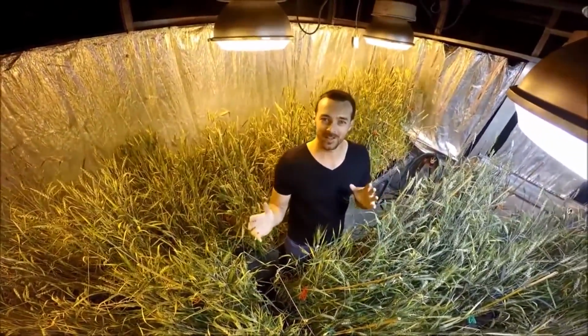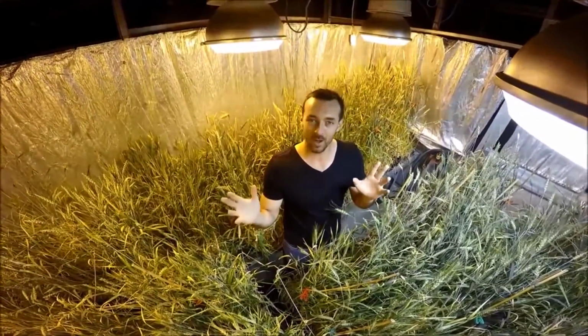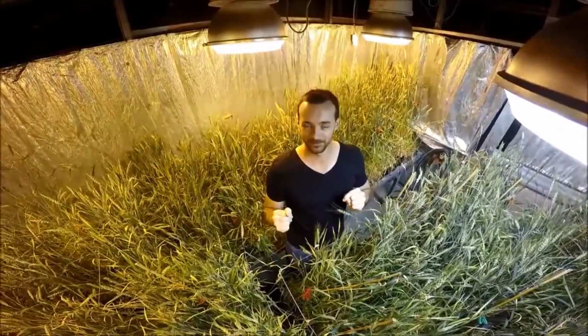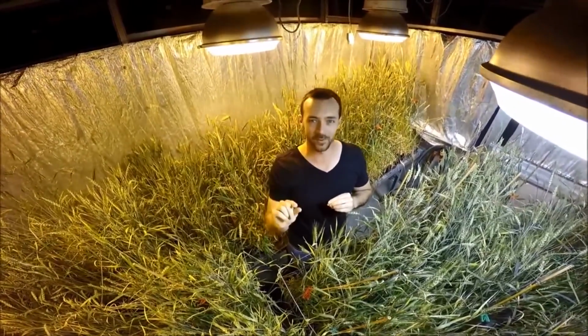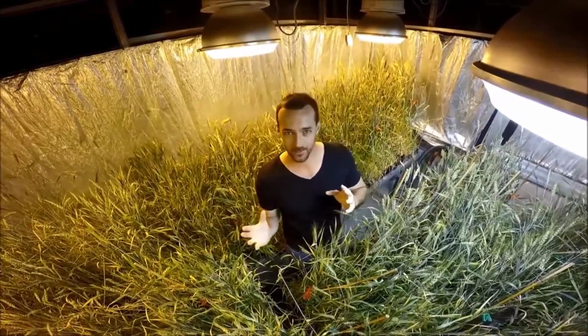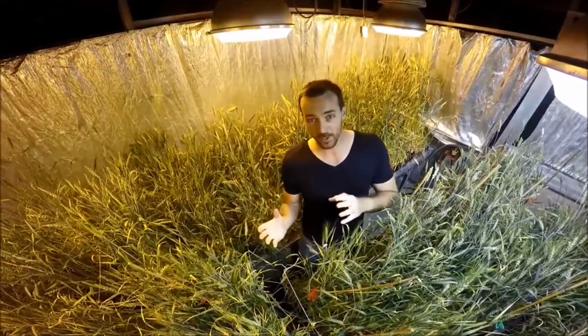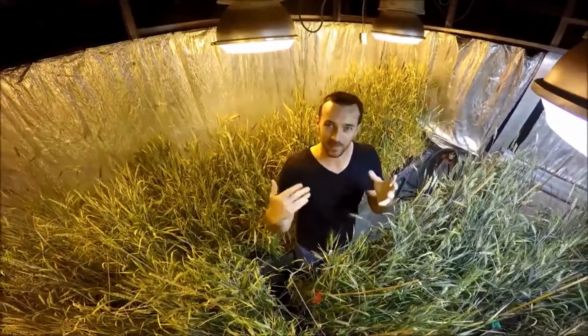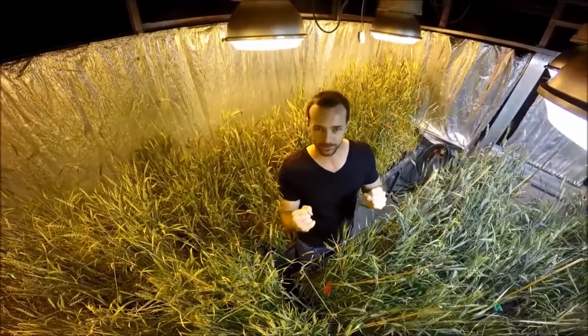This is just one of the glass houses we have here at the University of Queensland, fitted with lights to extend the photo period. In this glass house we can control the temperature plus or minus 1 degree, so it gives us great precision to manipulate plant growth. Of course, we often change the photo period from constant light to accelerate plant development, sometimes to diurnal photo periods depending on what we're doing.